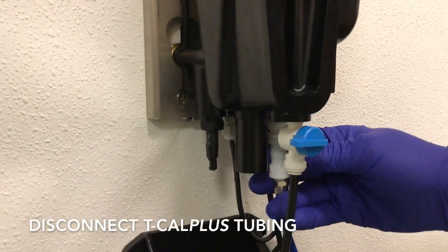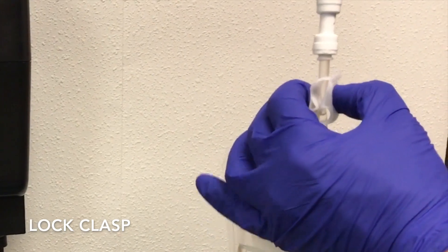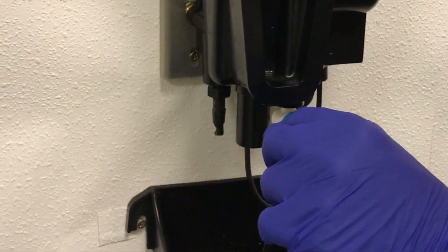From here, disconnect the TCAL Plus tubing, lock the tube clasp, and resume flow.